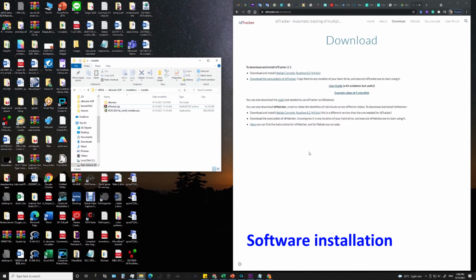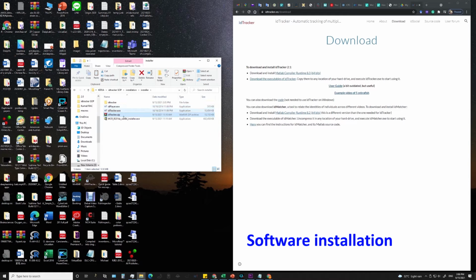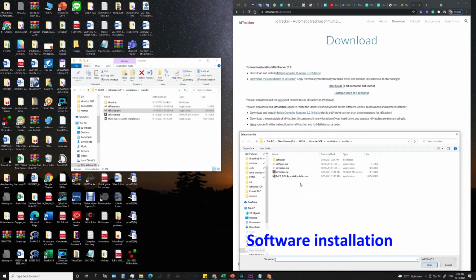After finishing installing the MATLAB Compiler Runtime, we extract the idTracker file. We choose extract here, and then it's ready to be used. And we select the video that we want.